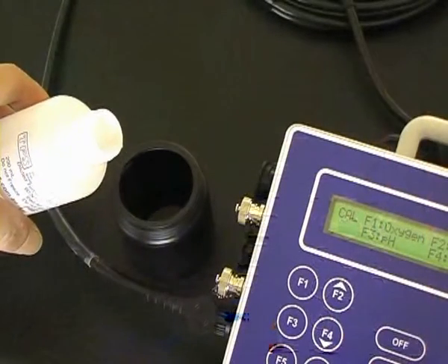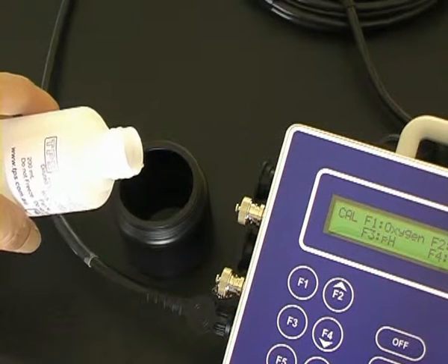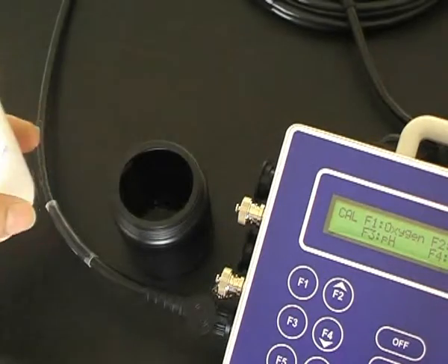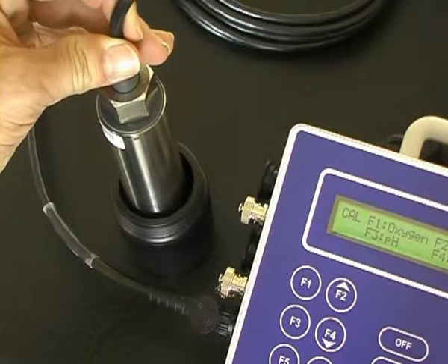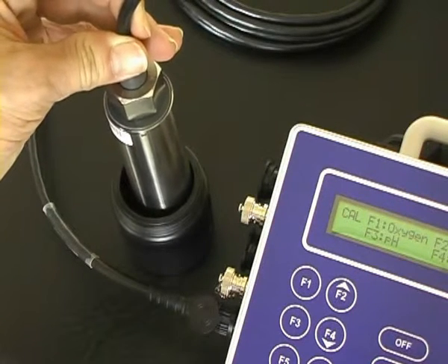The second point turbidity calibration is in the turbidity standard, such as 90 NTU, like this one here. Pour the standard into a black calibration jar. Place the sensor into the turbidity calibration solution, allowing sufficient space underneath — 30mm and around the sides.